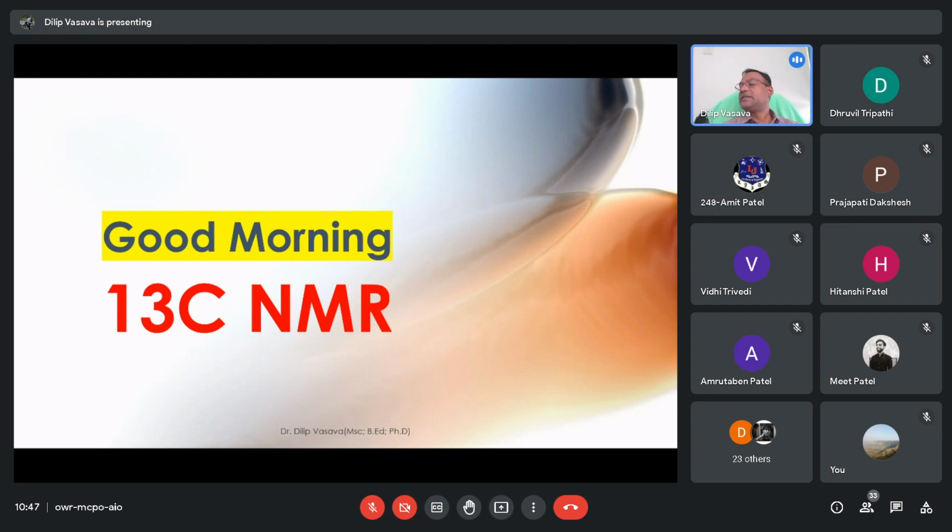In that way, it is 0, because in a shell both the spins remain anti-parallel. One is the value of I equal to plus 1/2 and the other is minus 1/2, so the net is equal to 0. So 12C is not showing any kind of intensity. That is why 12C is not used in spectroscopy, because it requires intensity. So the isotope of 12C is required.